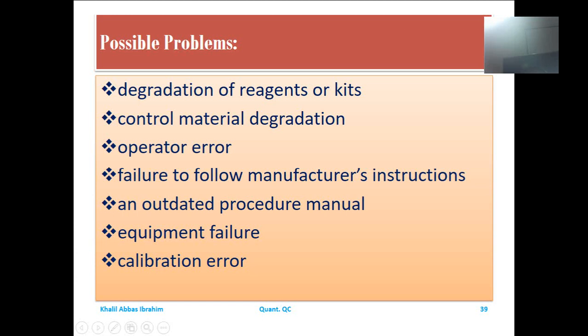If you use different lots or different reagents or different equipment, you need to develop or update your procedure so as to meet the new situations, but never use an outdated procedure manual, or any manual which is unrepresentative of the technology, procedures and resources that you are using in the laboratory.